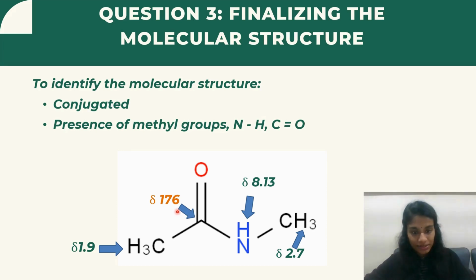In the case of off resonance, when the splitting is a singlet, it is not attached to H. So it is correct to arrange it in the middle, because it is attached to a C and also N.